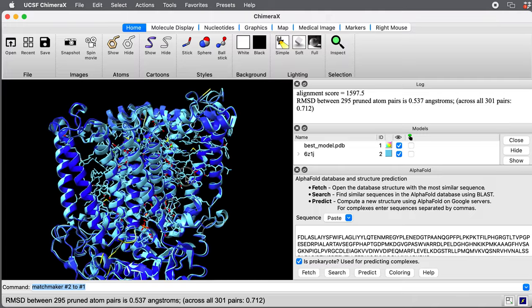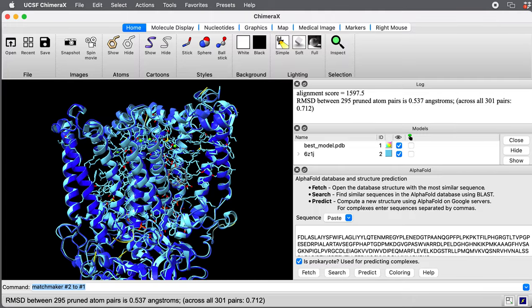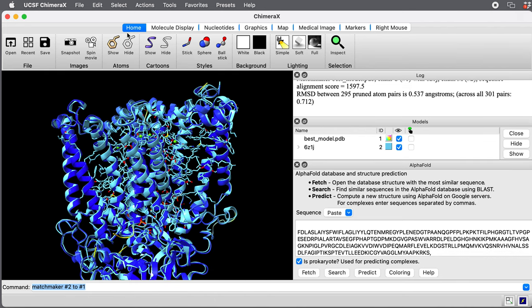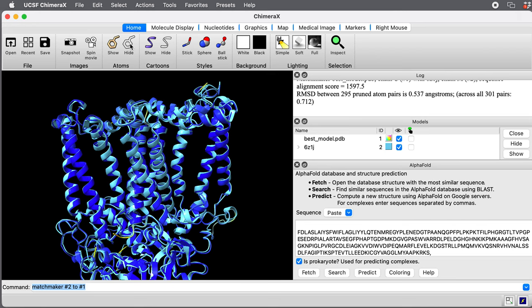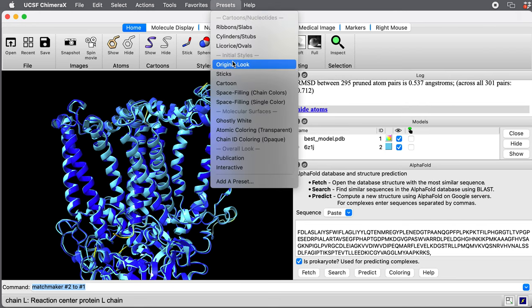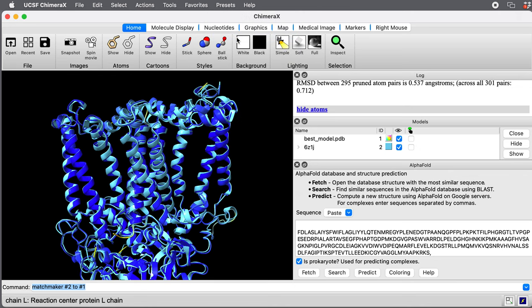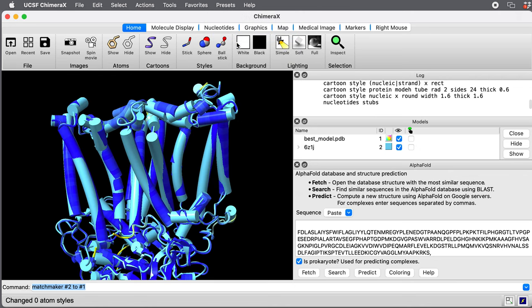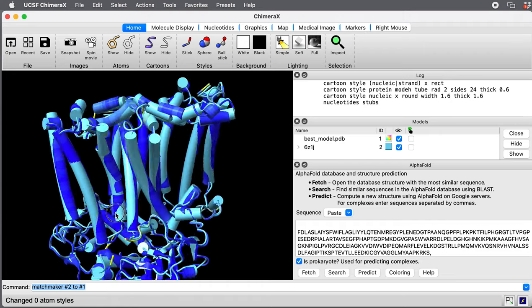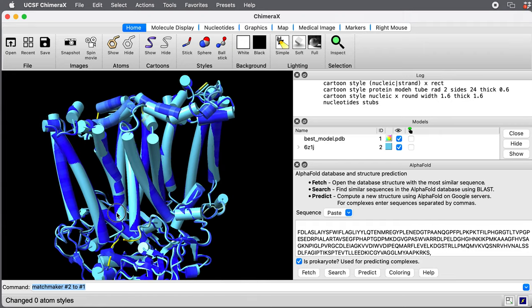To clarify things a bit, or make it a little simpler, I'm going to hide the atoms up here in the toolbar. Press that hide atoms. And I think under presets here, I'll choose a cylinder, which will make the alpha helices cylinders to make it simpler still for the comparison.